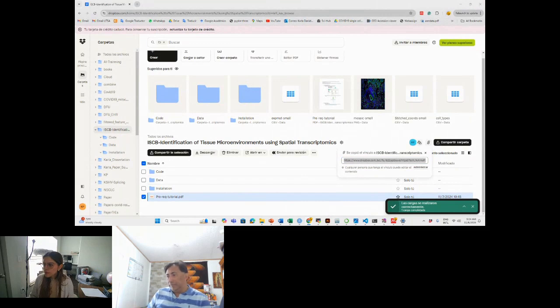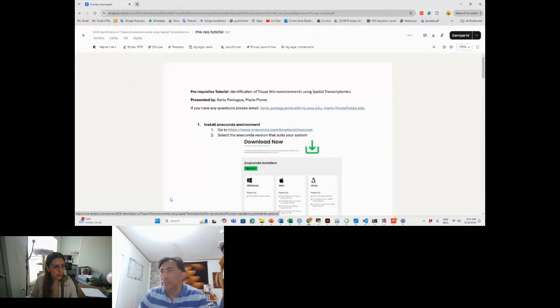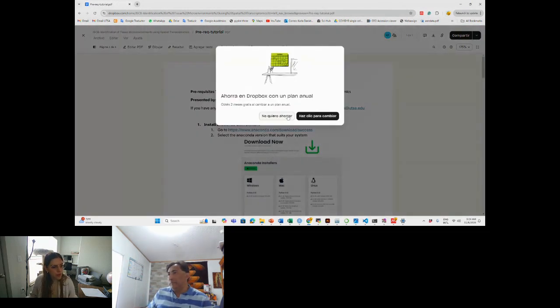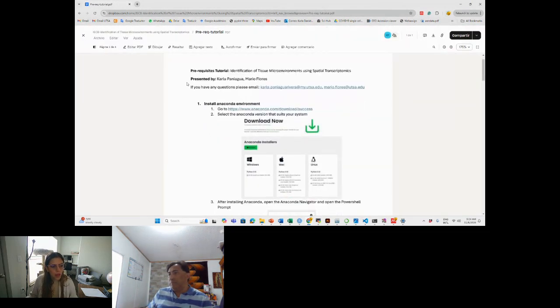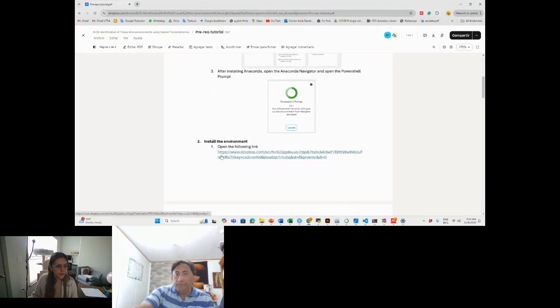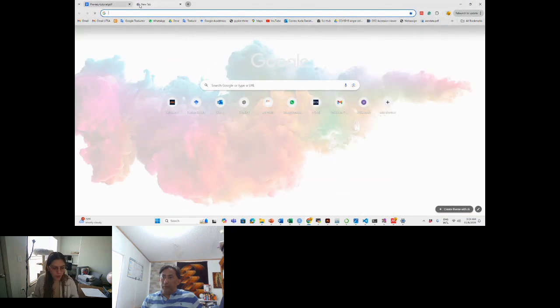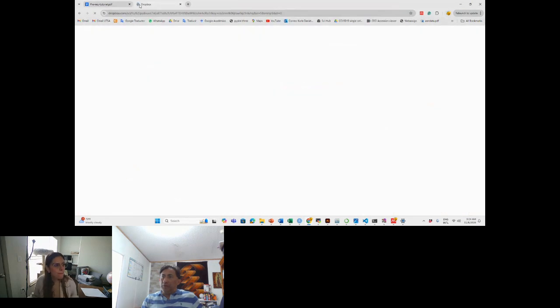you were starting. Okay, can you see my screen? Yes. So first, before starting, please open this file. So the first step is going to be to install Anaconda, which I already have in my computer. I hope you already did that. And then the second step is going to be to install the environment. So for that, you have to go to the link. I'm just pasting it again.